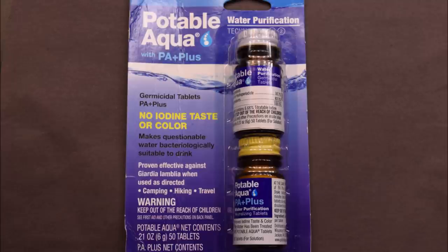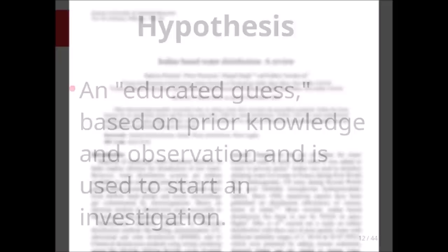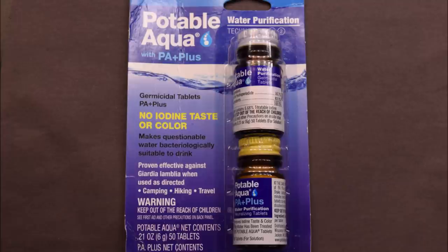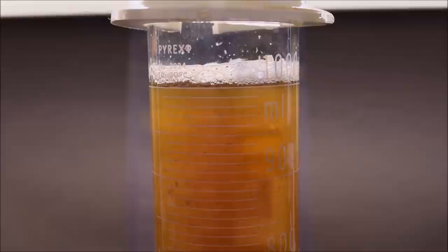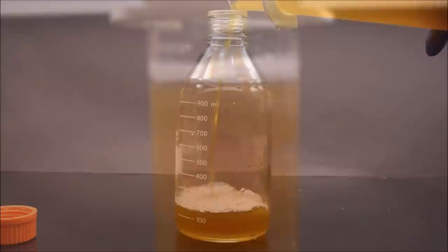So what is going on here? Does my experiment show these tablets don't work? Well, not quite. The scientific literature, as well as many campers and hikers' experiences, has plenty of evidence to support the notion that these tablets do work. But why didn't they work in my experiment? My hypothesis is that these tablets do work, but they are meant to be used on clear water, not water that looks like this. I think water that is this dirty is just too much for the tablets to deal with — maybe there are just too many bacteria for these tablets to kill.